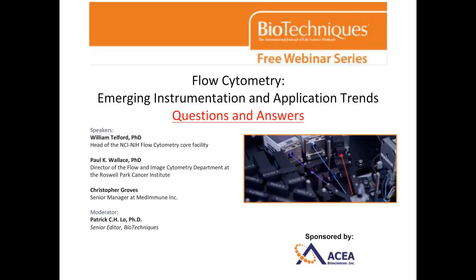So it shouldn't really be any more of a problem than any other digital systems now, where you can be processing many events simultaneously, and a cell does not have to clear all of the beam intercepts before another cell can be analyzed. I'm not absolutely 100% sure of this, but I do think that you shouldn't see an issue here any more than you would in, say, a more advanced BD system where you have 5 or 6 laser intercepts. You can analyze more than one cell simultaneously, and that significantly reduces the number of aborts.